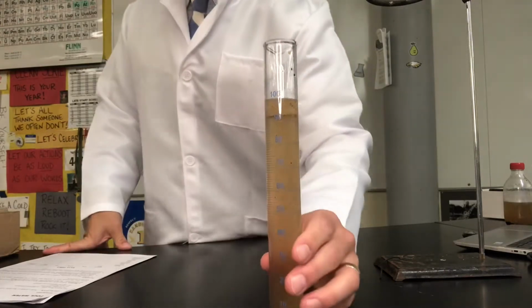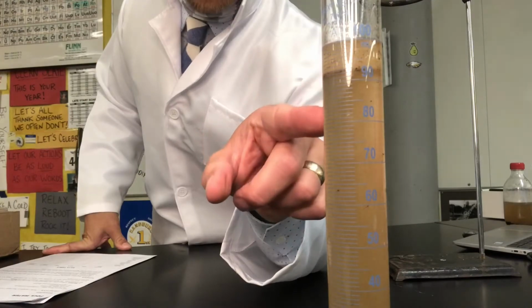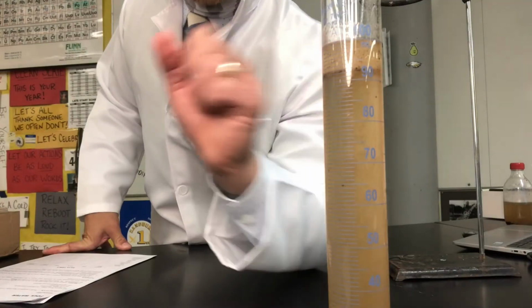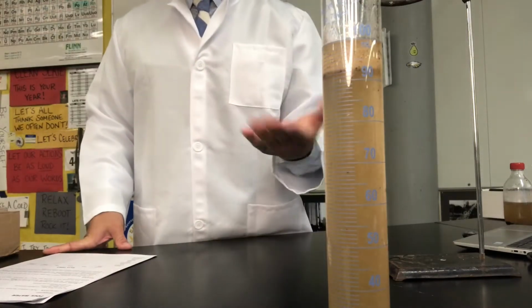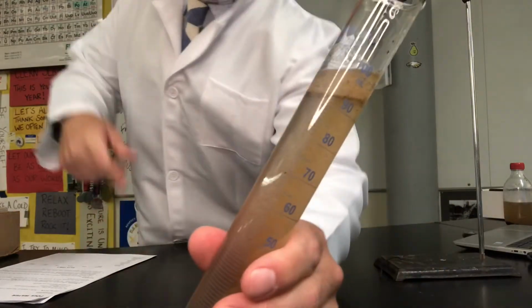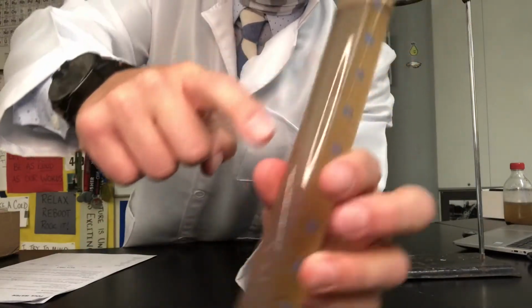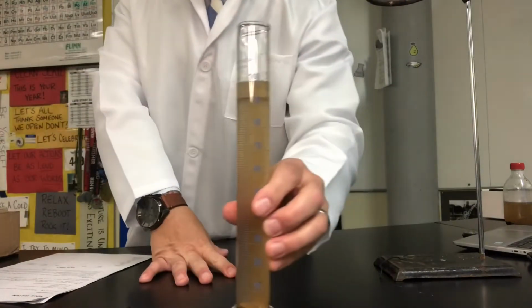As far as presence of oil, if you take a look, you can see the separation between the water on the bottom and some type of oily substance on top. So the answer for your data table would be yes, there is a presence of oil. And is there a presence of solids? You can see some of the chunks of solids right there and also at the bottom. So the answer is yes, there are still solids in there.